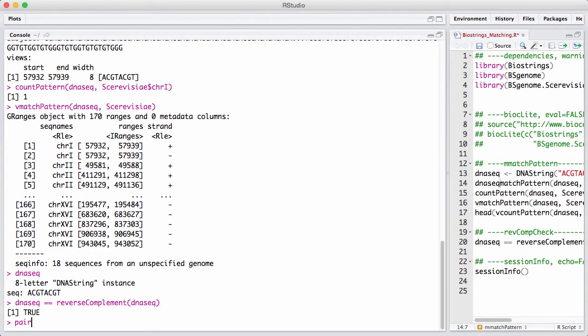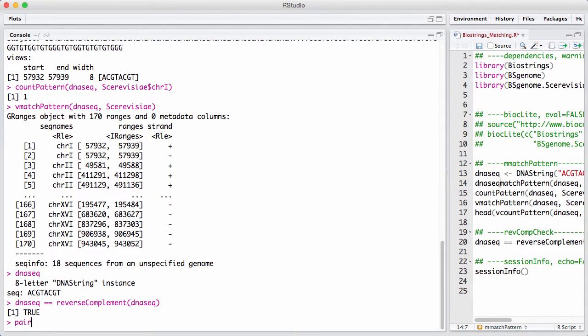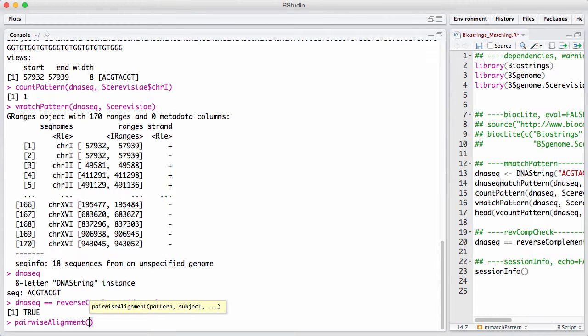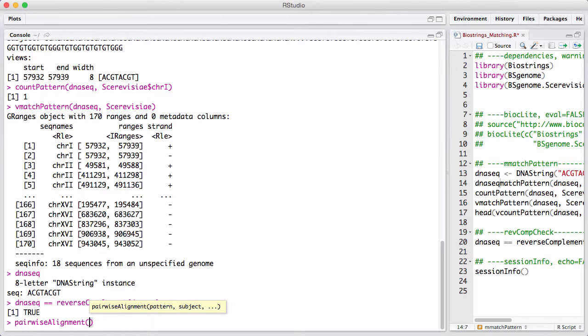Then we have a function called pairwise alignment. Pairwise alignment implements a classic pairwise alignment algorithm that's known in computational biology, either a global pairwise alignment or a local pairwise alignment like a Smith-Waterman or Needleman-Wunsch type algorithm.